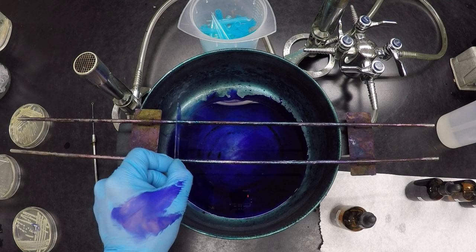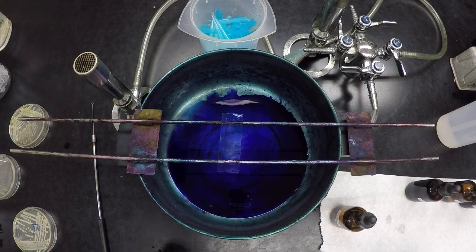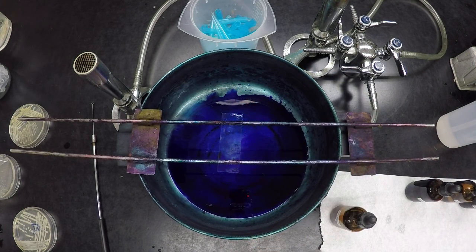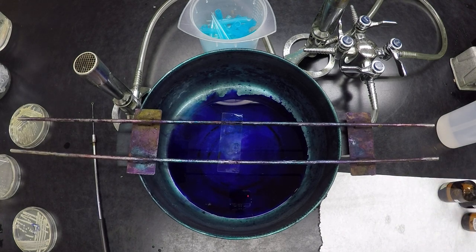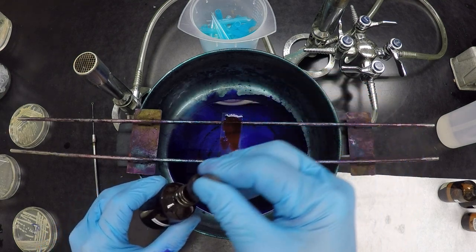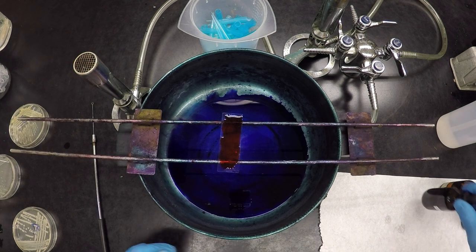Good. So if we have done everything correctly, at this point we have our gram-positive cells. Our labels are coming off, but that's our gram-positive cells. They should be purple. Our gram-negative cells here will be colorless, because we decolorized them. So our counterstain will color our now decolorized cells. Here we go, just like before, we're going to add that in there. Now, just to add a little bit of confusion, what our safranin is actually going to do is color all our cells.